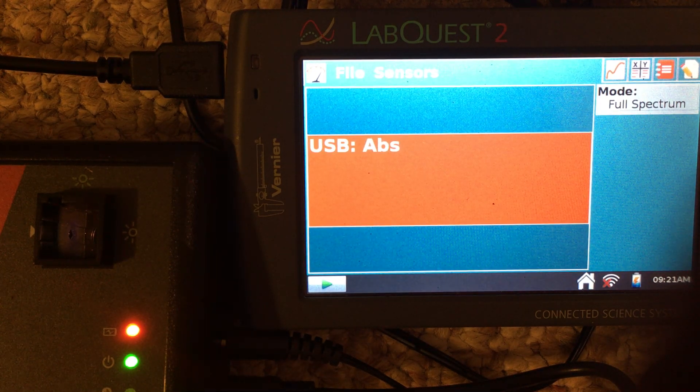This video describes making and using a calibration curve for the SpectroViz spectrophotometers. First, make sure everything is connected together: all power supplies are plugged in, the SpectroViz is connected to the LabQuest 2 module, and then you move on to actually warming up the spectrometer.